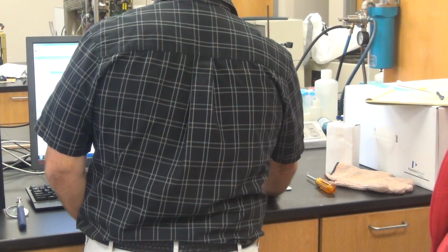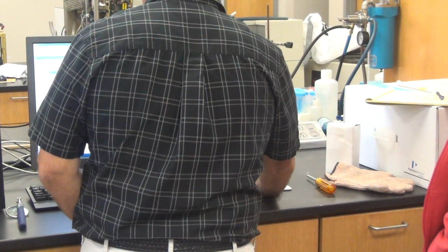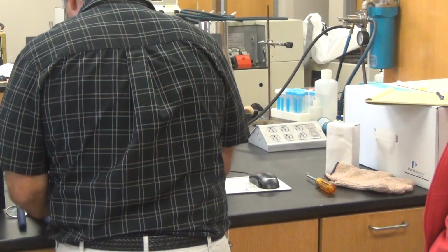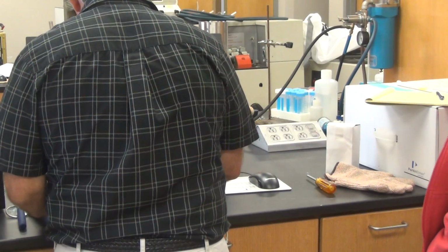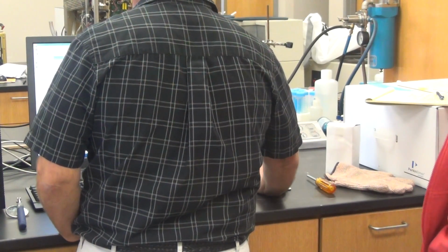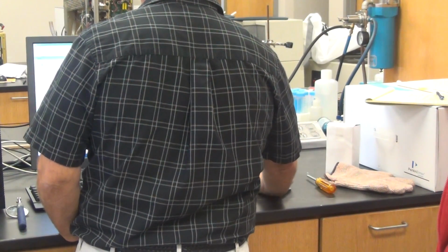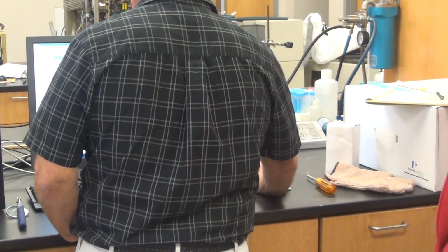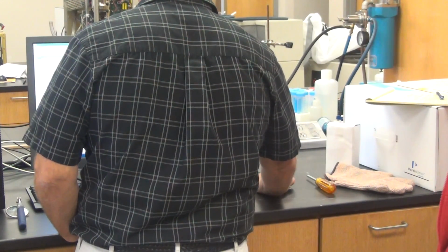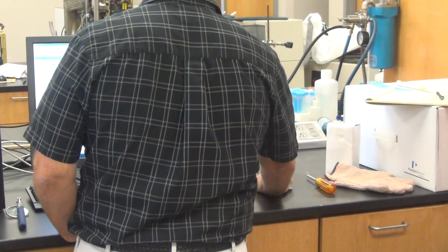So this is Chrome. Go to analysis, so we're going to save as. Save the workspace. Save furnace auto. Bring it up. Save as. Call back up your method. What I didn't want you to have is this one in there.